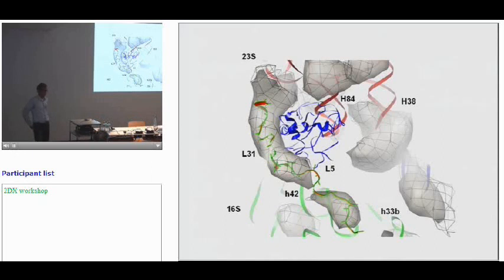I think the only way around this is to collect more data so that you bring down the sigmas. I think in Richard Hyde's presentation yesterday, we saw some lattice line fitting where the sigmas were really huge, yes. And this information will be lost in the processing later on. So you have to bring that down, and the only way out, I think, is to collect more data. Okay.